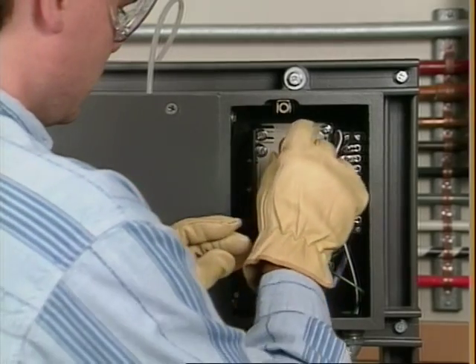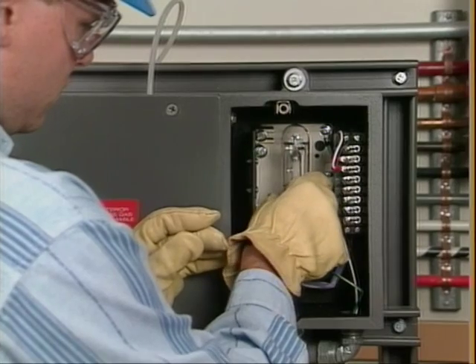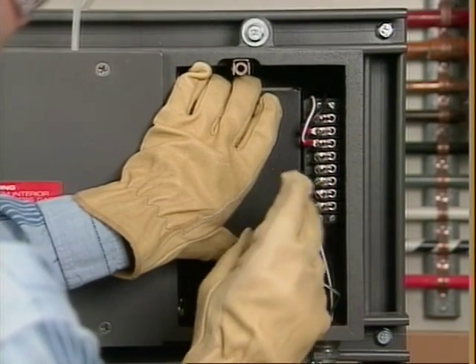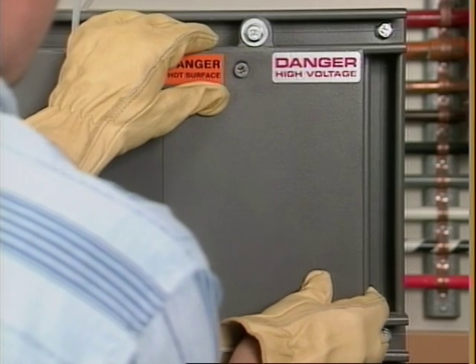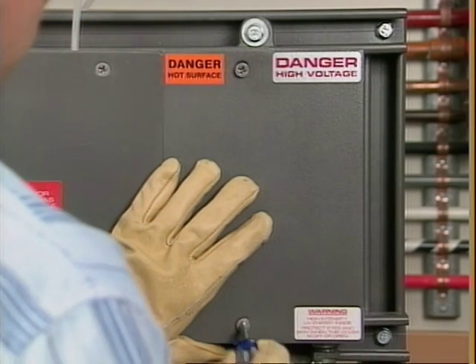If any oils or grease accumulate on the lamp, try cleaning it or obtain a new bulb. You should also ensure that the lamp shields are grounded according to the manufacturer's guidelines. Turn on the analyzer. If the bulb illuminates, give it time to stabilize before calibration. Calibration is discussed later in this program.